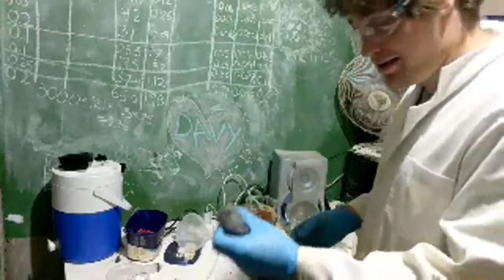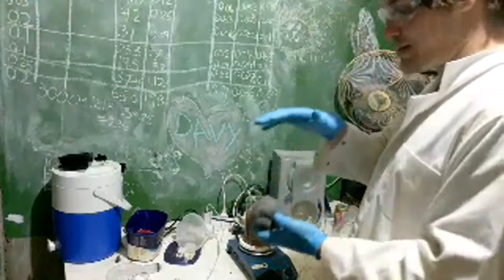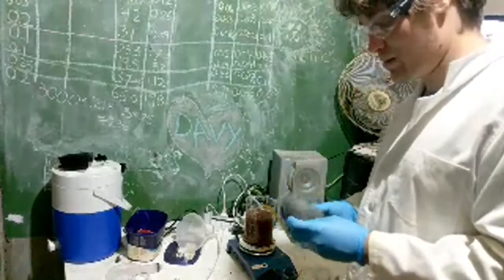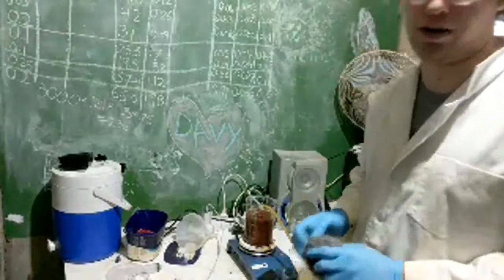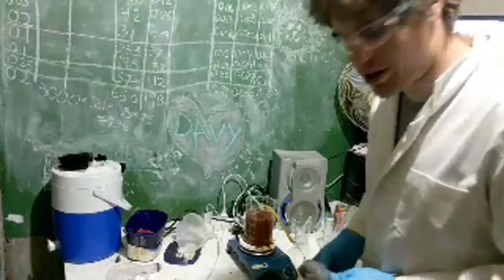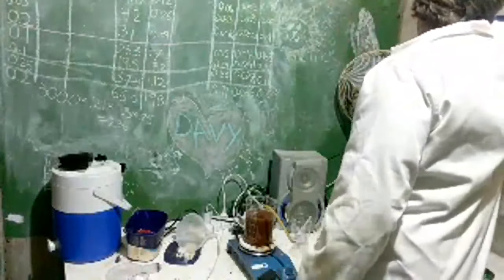This is iron, and I reckon if we put this in a metal container with a whole lot of potassium nitrate, light it on fire, I reckon we'll make some ferrates that way, and then we can just extract it with water. What could possibly go wrong, right? Please let me know what could go wrong. All right, but that means we need nitrates.